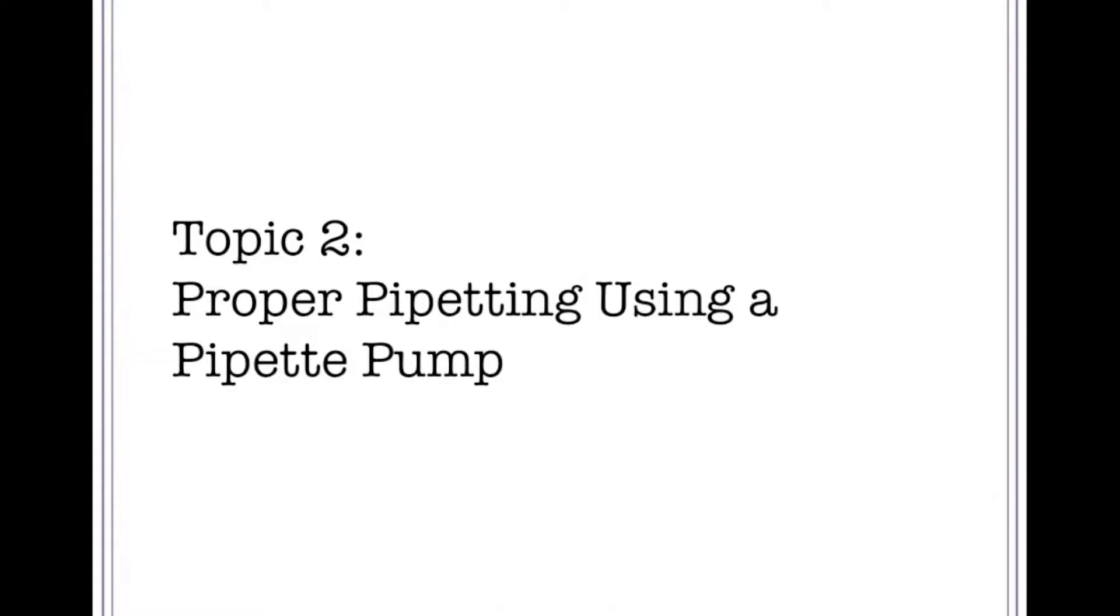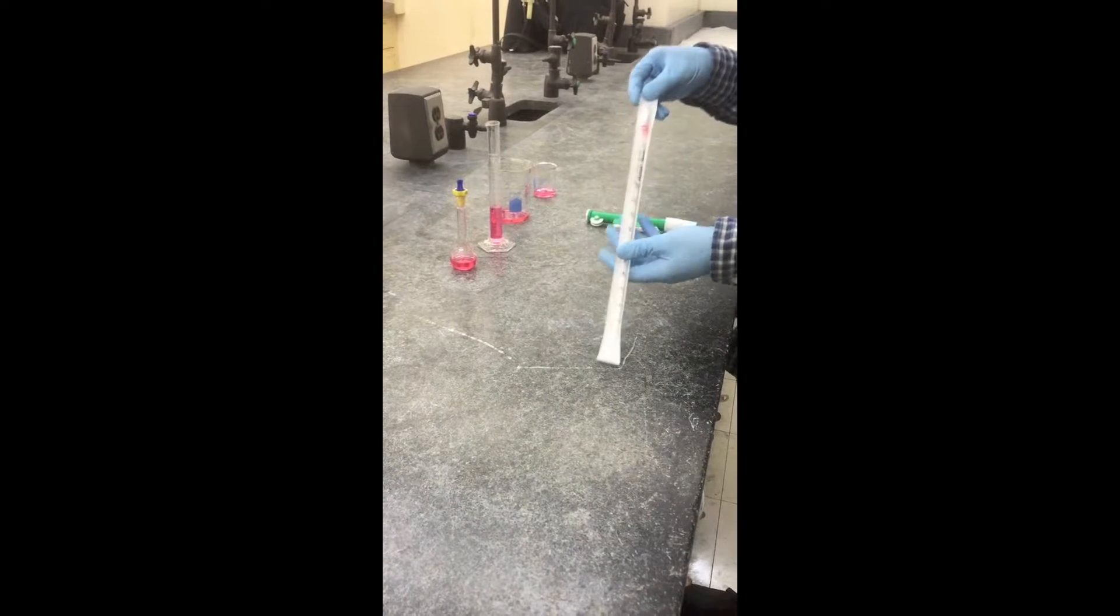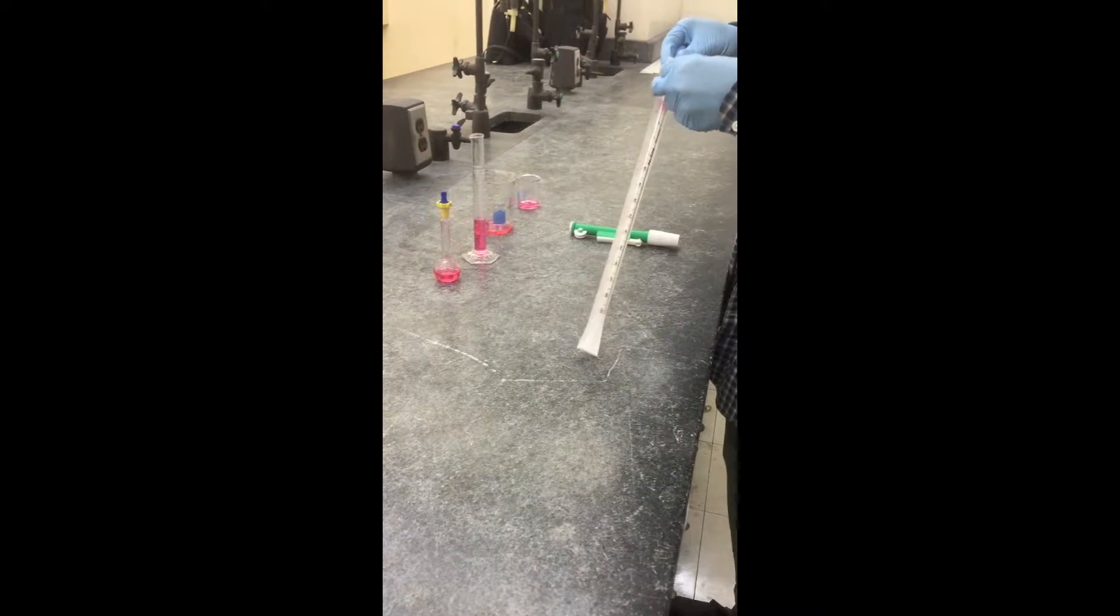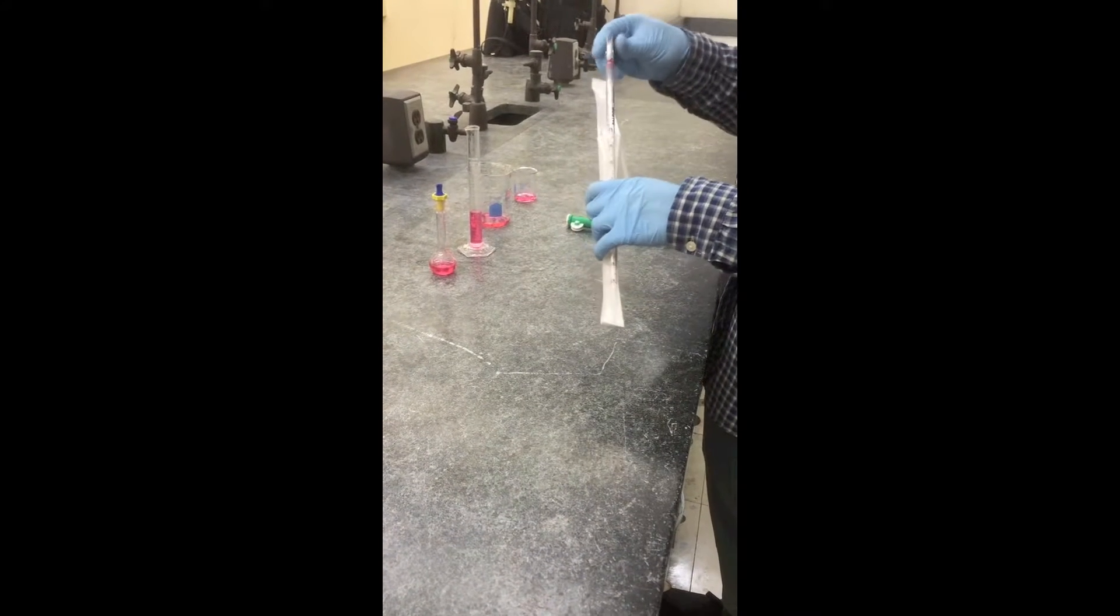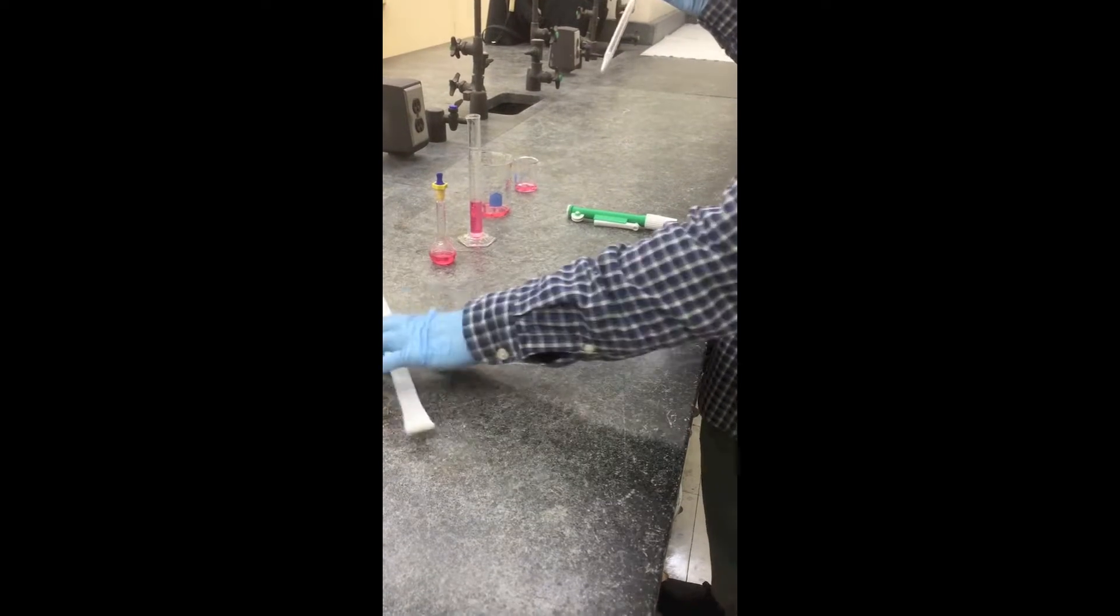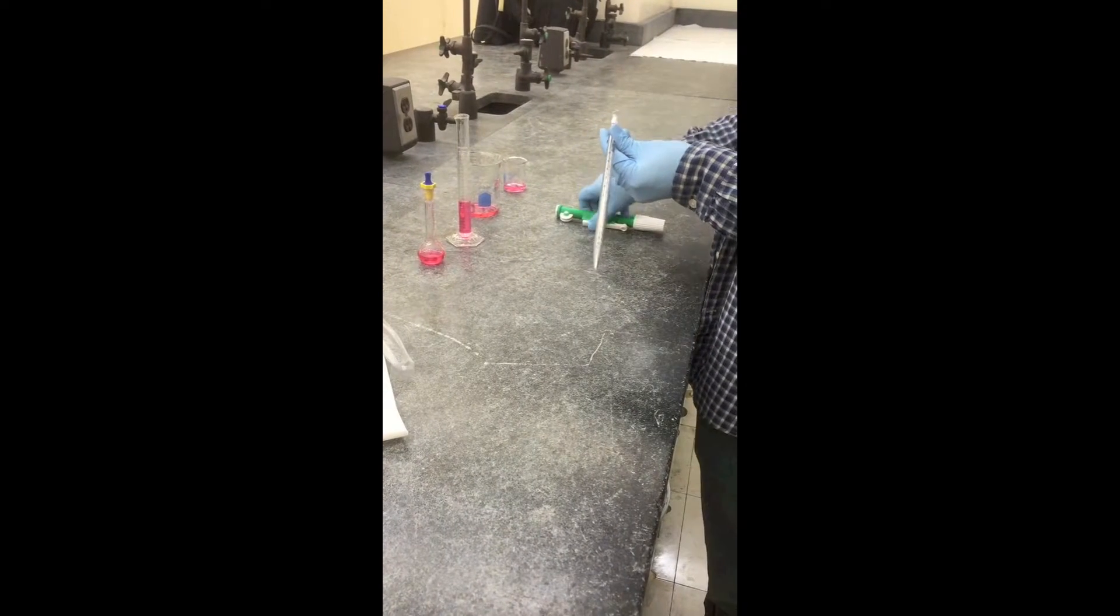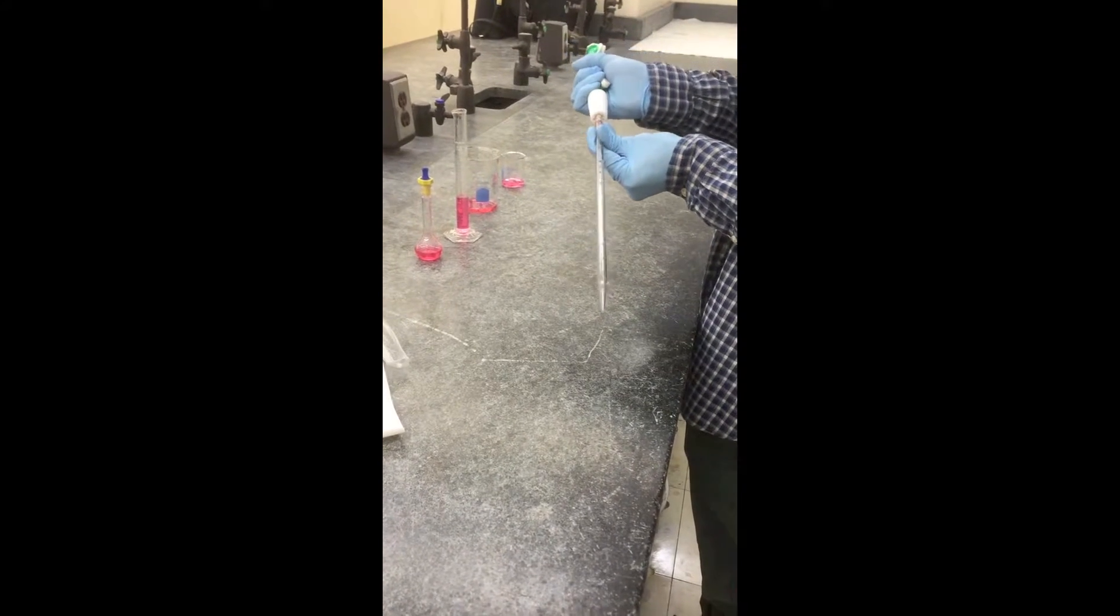Next we will demonstrate the proper use of a pipette pump. Carefully remove the pipette from its wrapping.